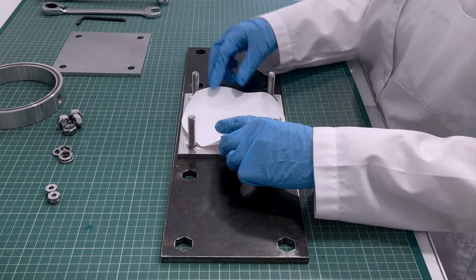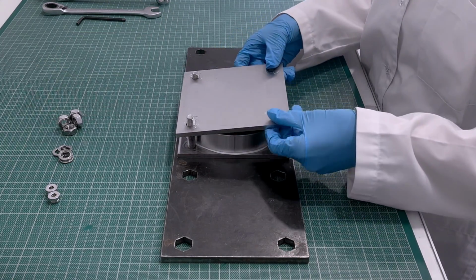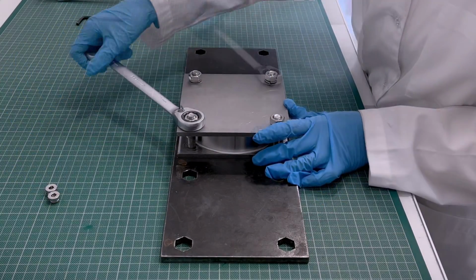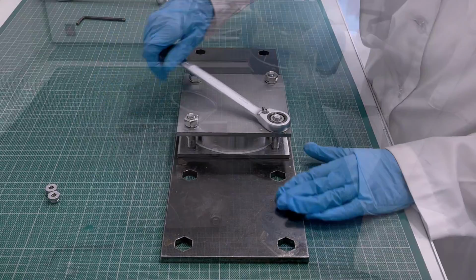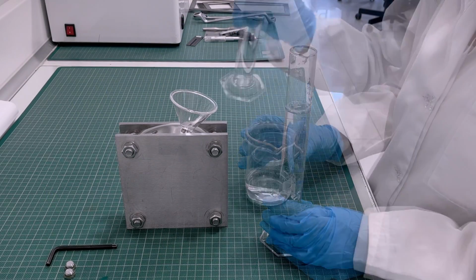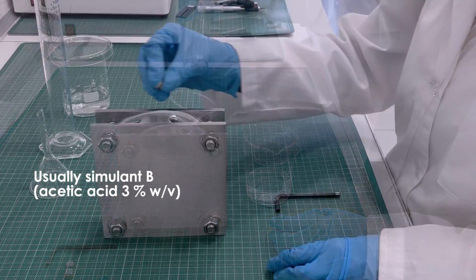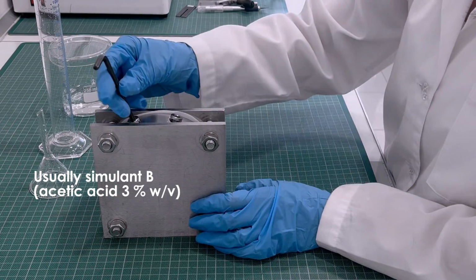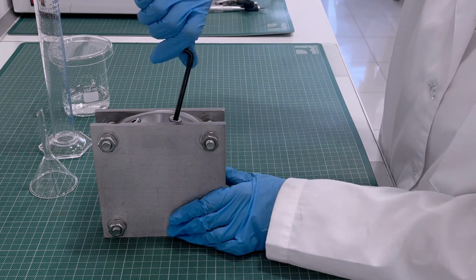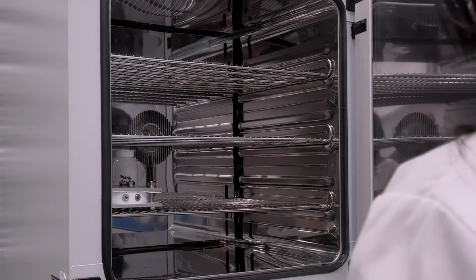Specimens are placed in a properly designed incubation cell which does not contaminate the sample with additional elements. At the second step, simulant is inserted in the cell, which is then sealed tightly to avoid evaporation. The sealed cell is then placed in an incubation oven.